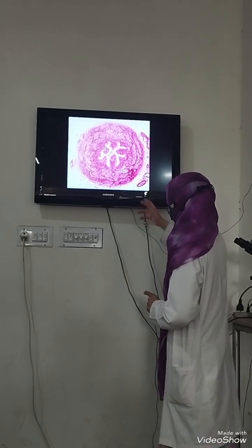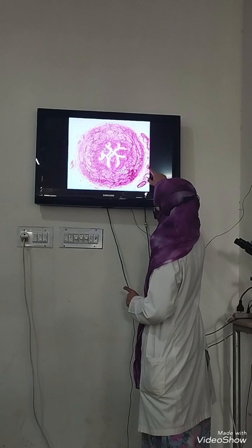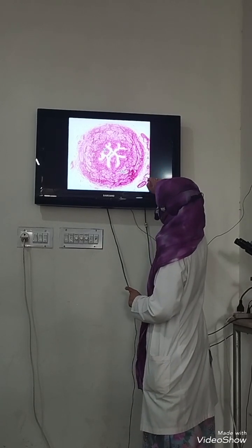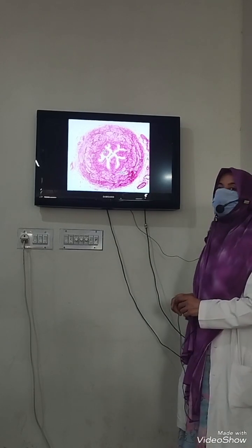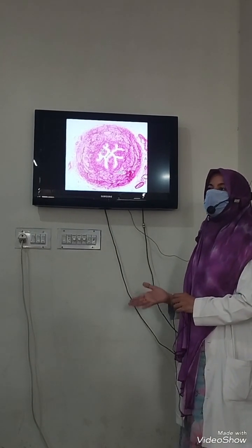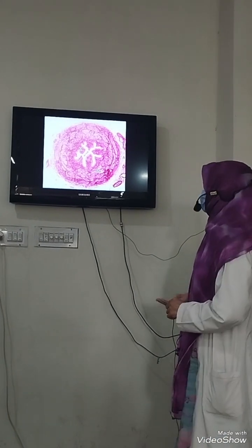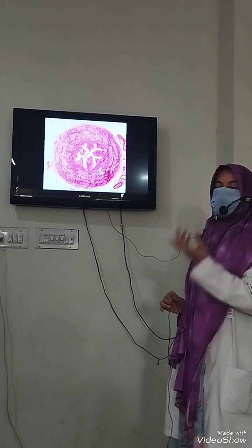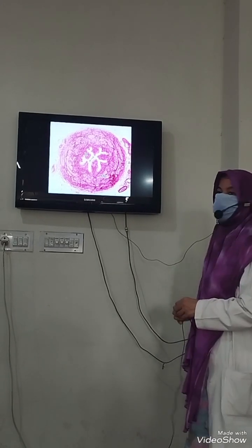That is well loaded with adipose tissue and definitely the neurovascular bundle. You can see so many cross sections of the blood vessels around, right? And that is showing its loose connective tissue nature in the adventitia. And again, we know the difference between adventitia and serosa. How does serosa appear? How is serosa different from adventitia?